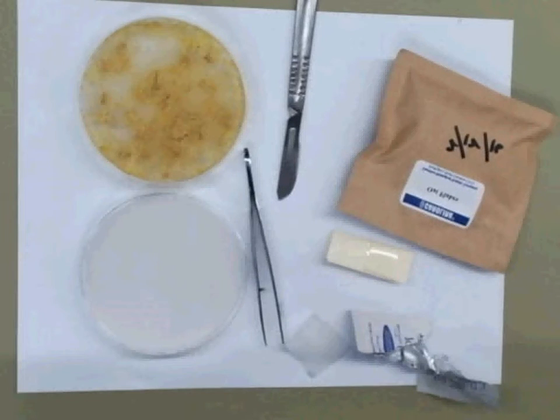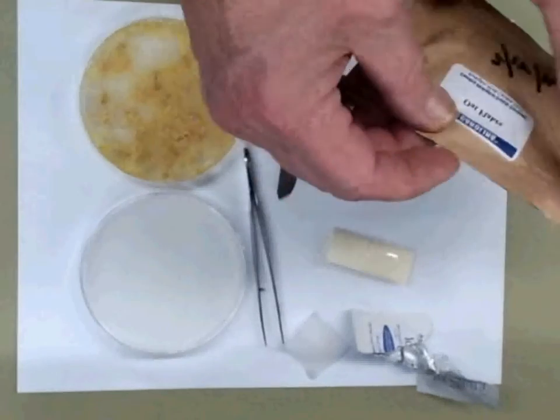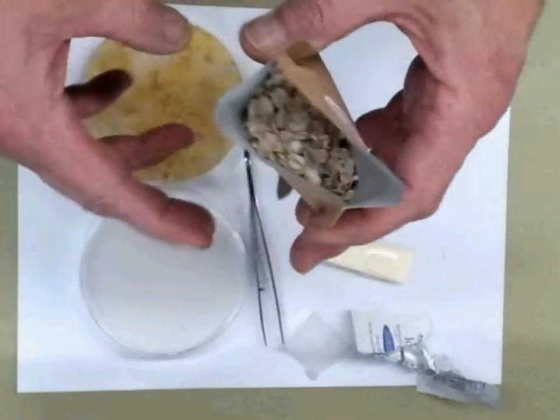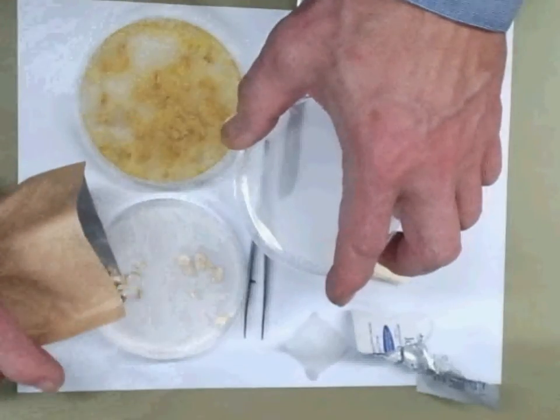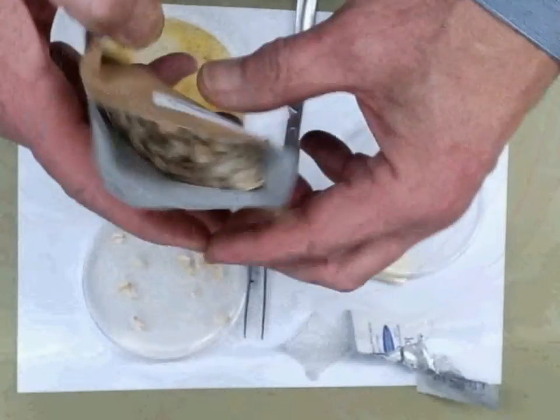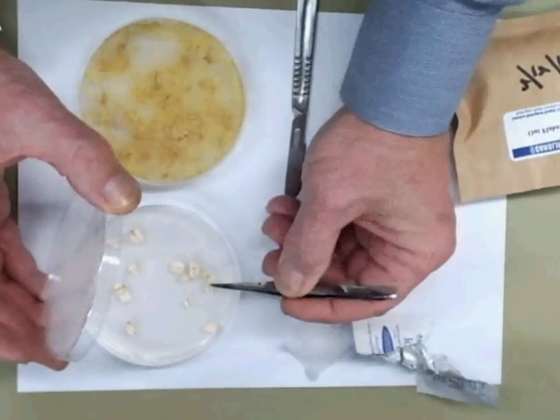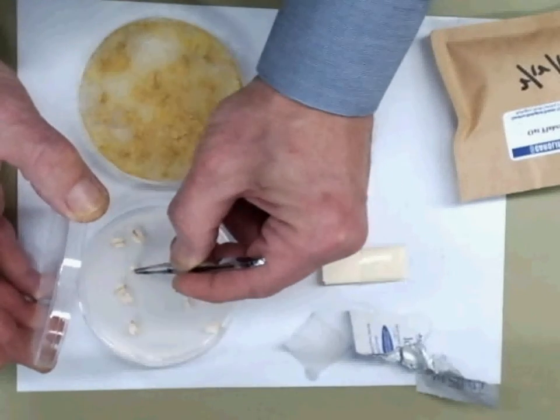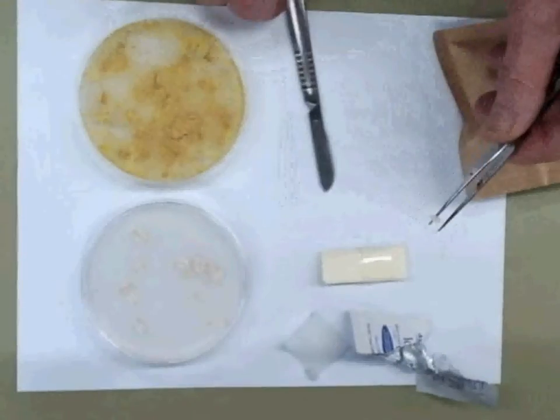Now we're going to load the subculture plate with food — with the oat flakes. I'm going to get a couple of oat flakes from this sterile container. I'll just pick out a few — that's more than enough. Then I'm going to press these into place with my tweezers so they stay in the agar and don't move around too much.